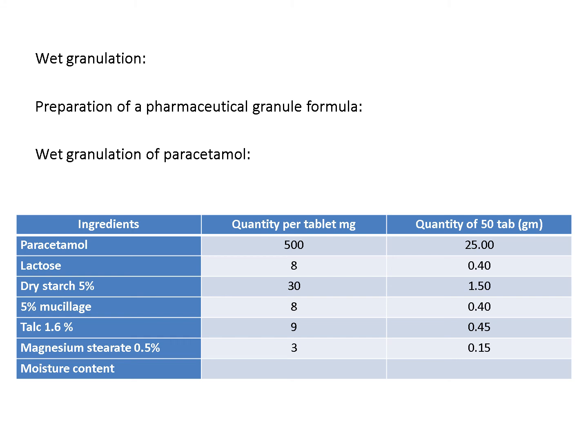Because it is a suspension, the 5 ml small beaker will retain some small powder of the starch, so we use the rest of the 5 ml in the graduated cylinder to rinse the small beaker and add it into the large beaker. That will be 2.5 grams of starch in 50 ml of water. We put it on the hot plate and mix it for less than 1 minute. It will boil, and the color of that white mixture changes to a less white, viscous, translucent mixture.